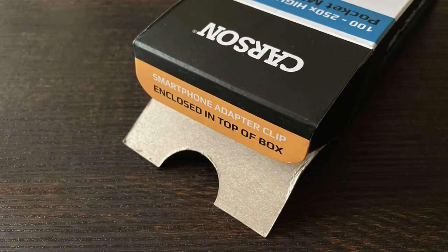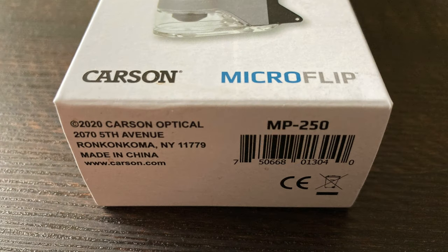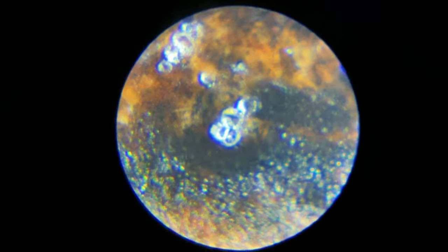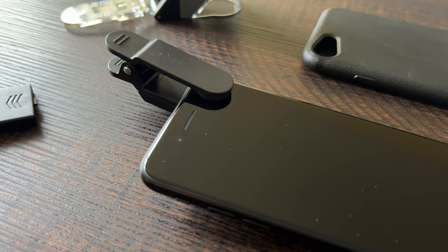While it didn't accomplish my primary objective, I don't regret the purchase — this thing is amazing. How is it doing 250x magnification at only $20? It can't be real, right? It is indeed for real. It does work. I was able to create digital images at the microscopic level. That's what's so neat about the Carson MP250.